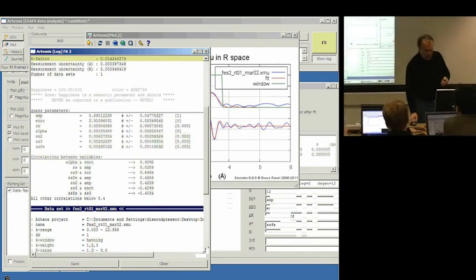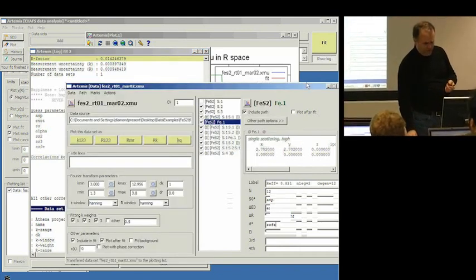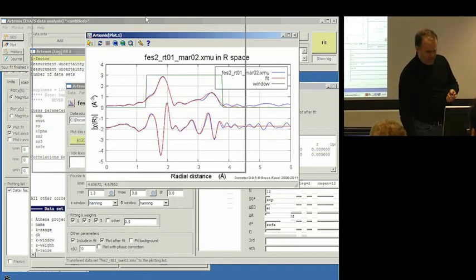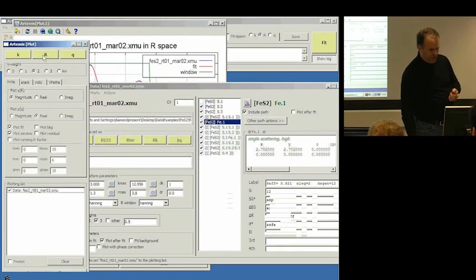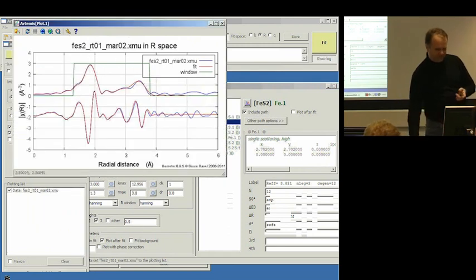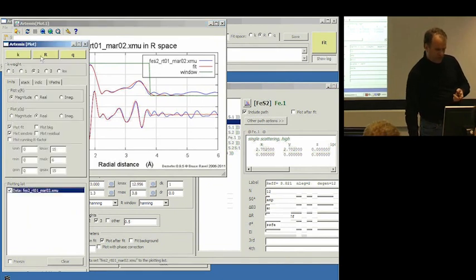A little bit more about the mechanics of the program. So suppose I go and I make this plot over here using, click. What is going on?